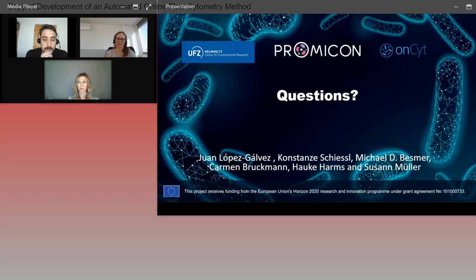Very good. And I think we can wrap with this final question. It's come in several times, so people are wondering what's next. What are your next experiments that you have planned with the online flow cytometry setup? Do you already have insight into how well the system is working with samples that are more real life than in the mock community? From our side, from the whole automation perspective, we are working a lot on really dense communities, maybe more challenging communities like wastewater. You might think, that's challenging to look at in a flow cytometer without sample pretreatment. So that's something we work on from the automation side.